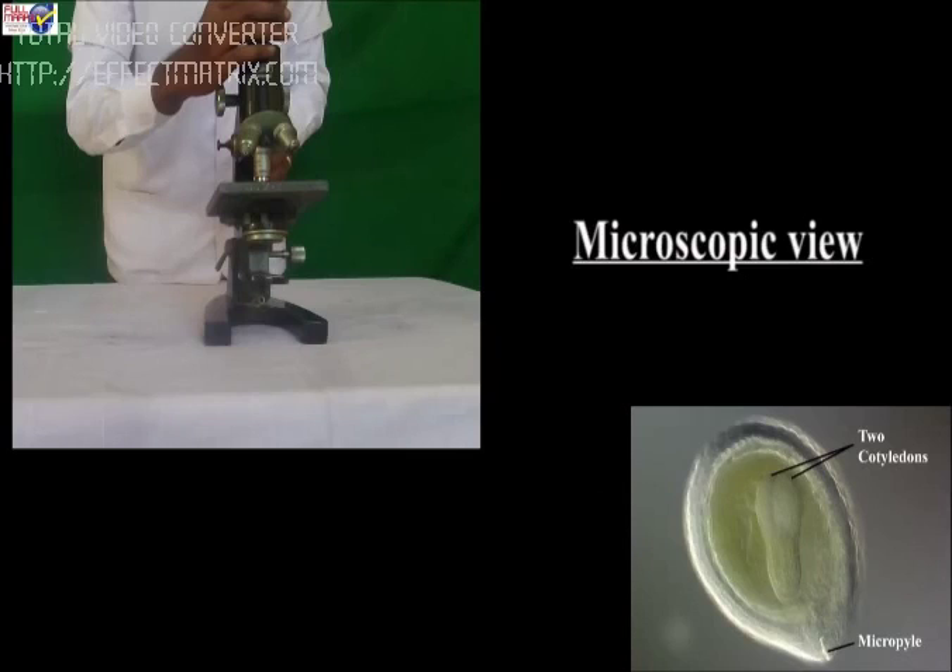Observation: The seed has a small pore called micropyle. It is a dicot seed, i.e., the seed has two cotyledons. The embryo axis shows radicle and plumule. The radicle is the future root and the plumule is the future shoot. The food is stored in the cotyledons.